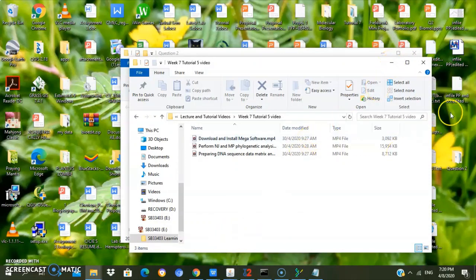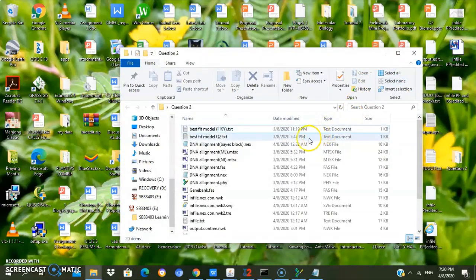After that, I already saved it as FASTA file. You need to open the MEGA software.